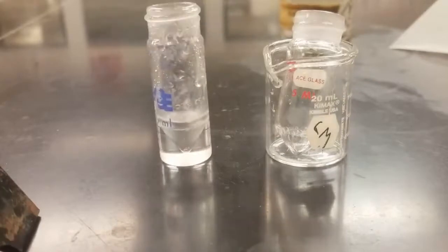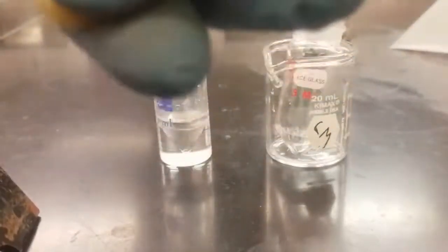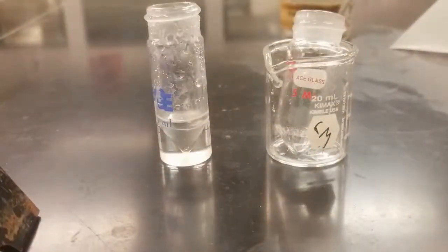And then we want to go ahead and just pick up just the bottom layer, and we want to try and do it in one go if we can. And so you want to pick this up fairly slowly. So squeeze the pipette when you're outside of the liquid. Squeeze the whole way. And then go ahead, insert into the liquid, into the bottom, and then start releasing. And you'll start picking up your methylene chloride.